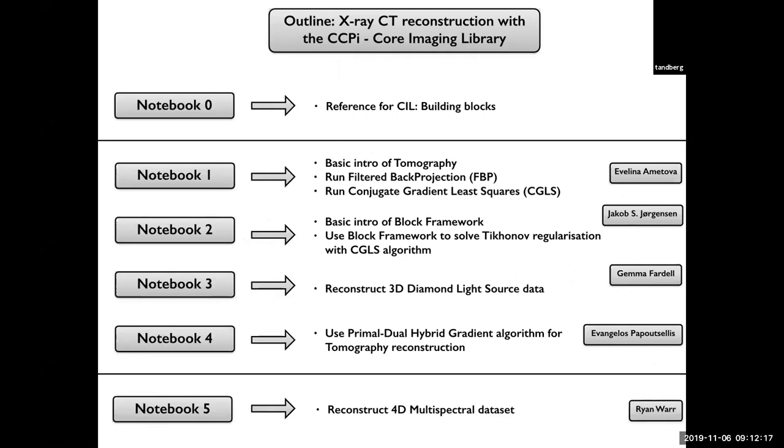And we'll start with Evelina, who will introduce a little bit of tomography, run FBP reconstruction, and CGLS. Then we'll go to Tikhonov regularization and introduce the block framework. Then we'll run real data from the Diamond Light Source, and then go to the PDHG and run total variation reconstruction. In the afternoon session, we'll do, again, total variation reconstruction for multispectral data.